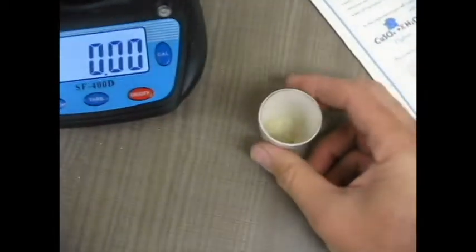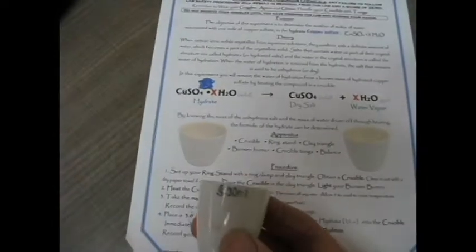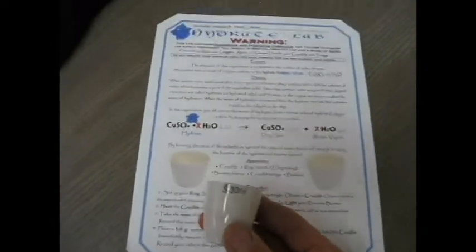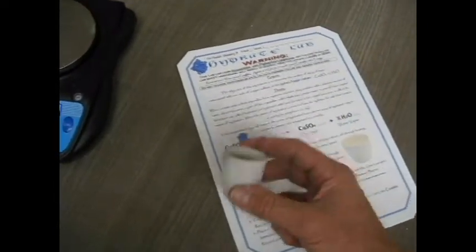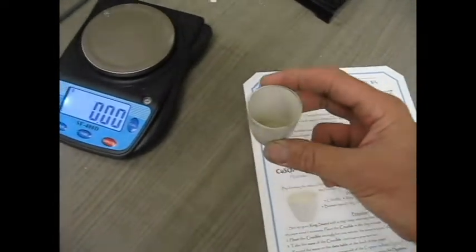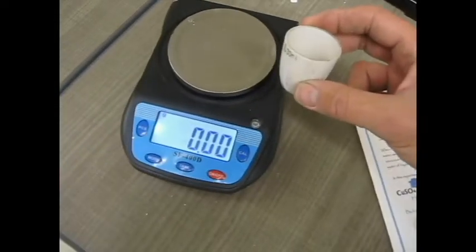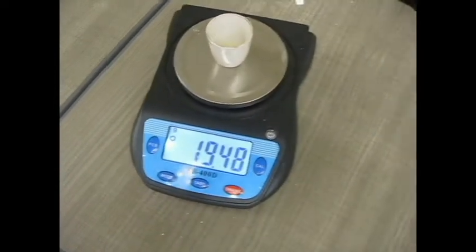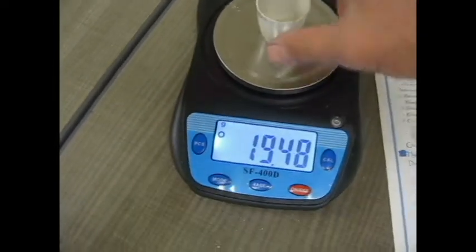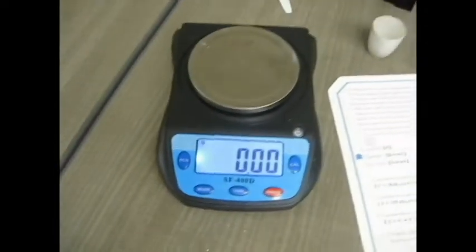Okay, here is my crucible. A crucible is a little device, a little cup that you can take to extreme temperatures, and it can take it. And you put something inside, and that will be taken to extremes. You see how it behaves under extreme conditions, like The Crucible by Arthur Miller. We need to know the mass of the crucible, so write that down. That would go there. Mass of the crucible, A. Write that down. Okay, notice that I had tared my balance. Tare is the same as 0 on this one, okay, before measuring that.